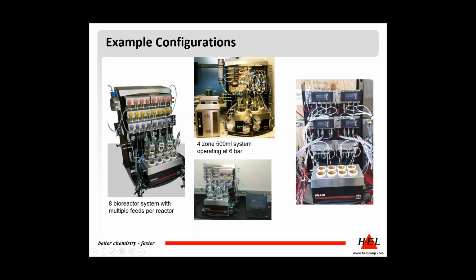Again, we have mass flow controllers located in various feeds. Again, you can see that in all cases the system can be quite busy, but this is because in the 50 by 56 centimeter footprint, you have to have quite a lot of resources available. On the bottom, you have the equivalent 4-zone system, but here we've got glass atmospheric pressure reactors.